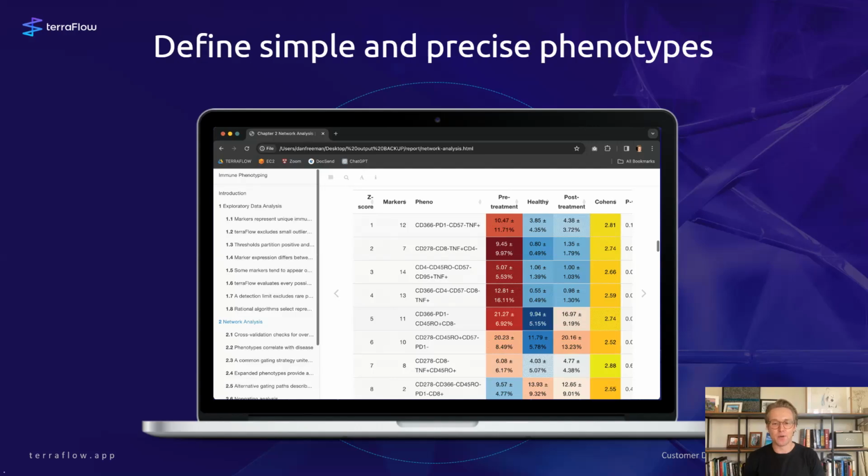So you can see that we've identified a list of cell types that differ between our patient groups. And for each of those cell types, we're reporting the average expression in each patient group, as well as a standard deviation. So if it's red, it means it has high expression compared to the other patients. If it's blue, it means low expression compared to the other data sets. Now, what's really interesting about this output is that we're not just labeling these populations POP1, POP2, POP3, but for each of these populations, we're actually going in and defining it with an explicit gating path that you can replicate across batches and across data sets.